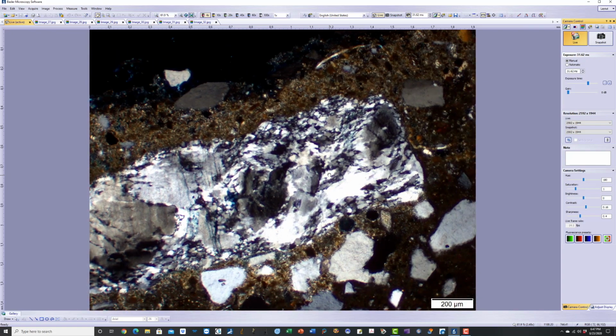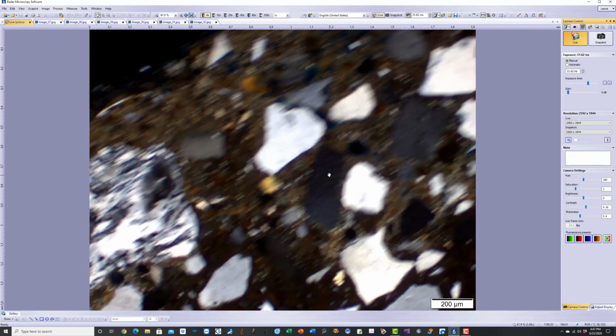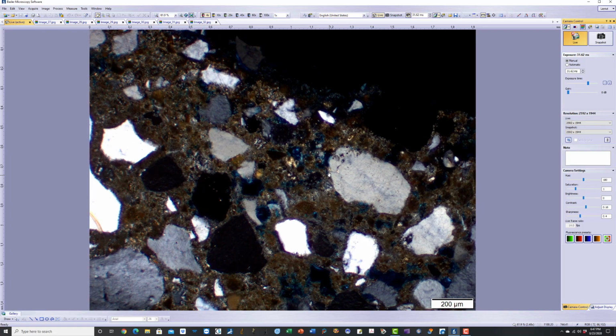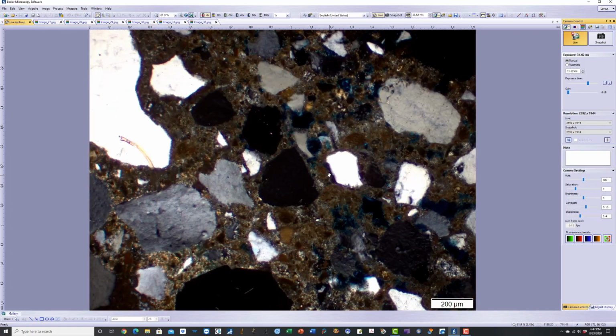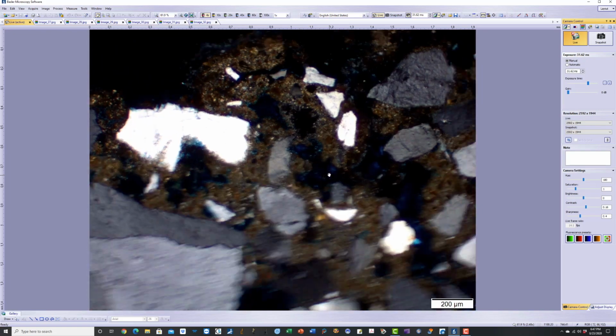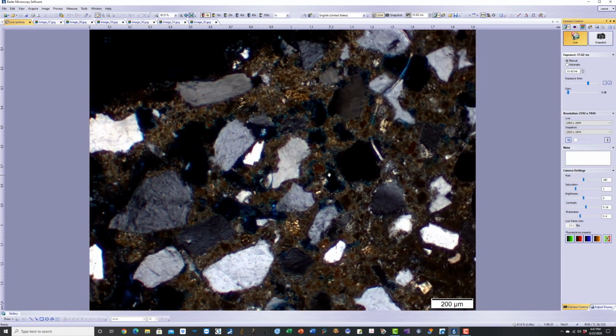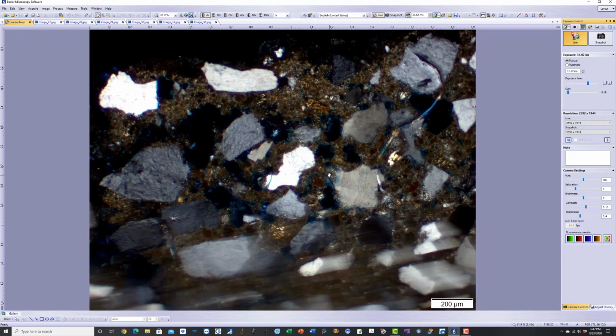There is a strained quartzite grain in the refractory mortar, mostly consisting of quartz sand, single crystal and polycrystalline quartzite. Many of these grains are strained, with undulose extinction.